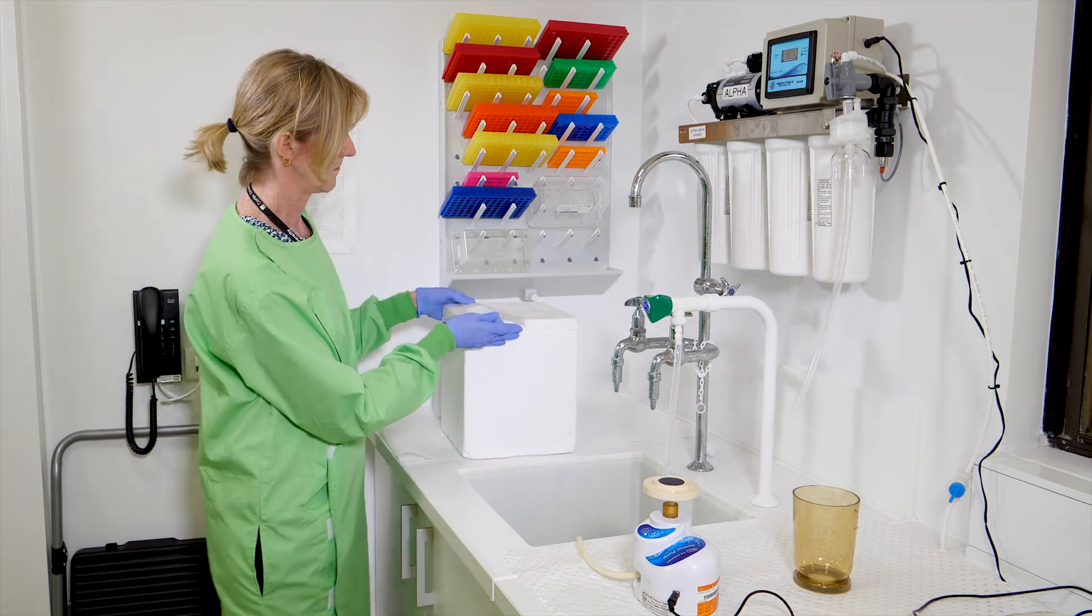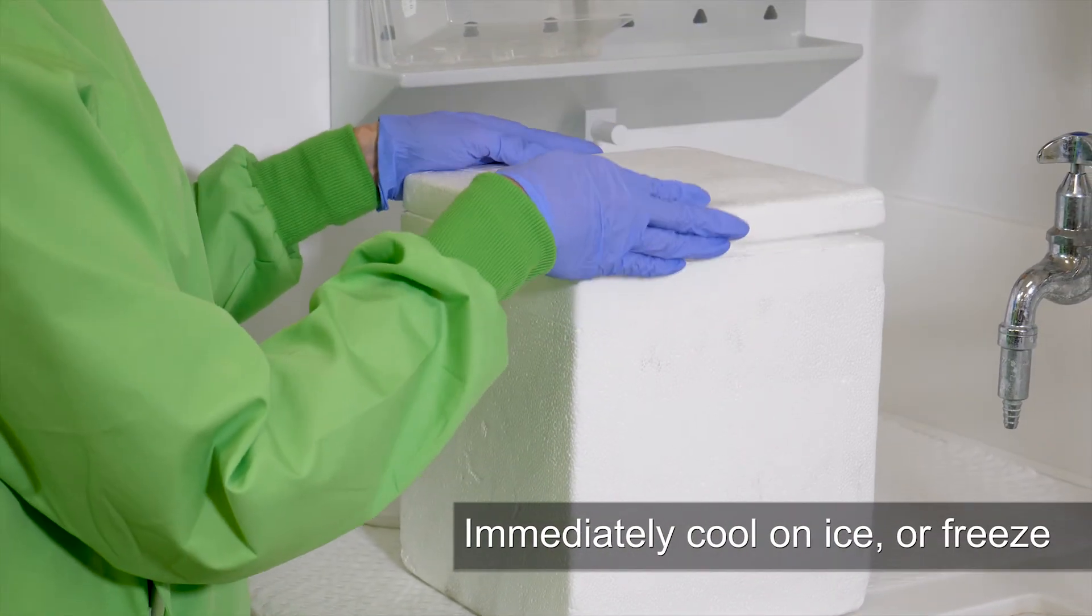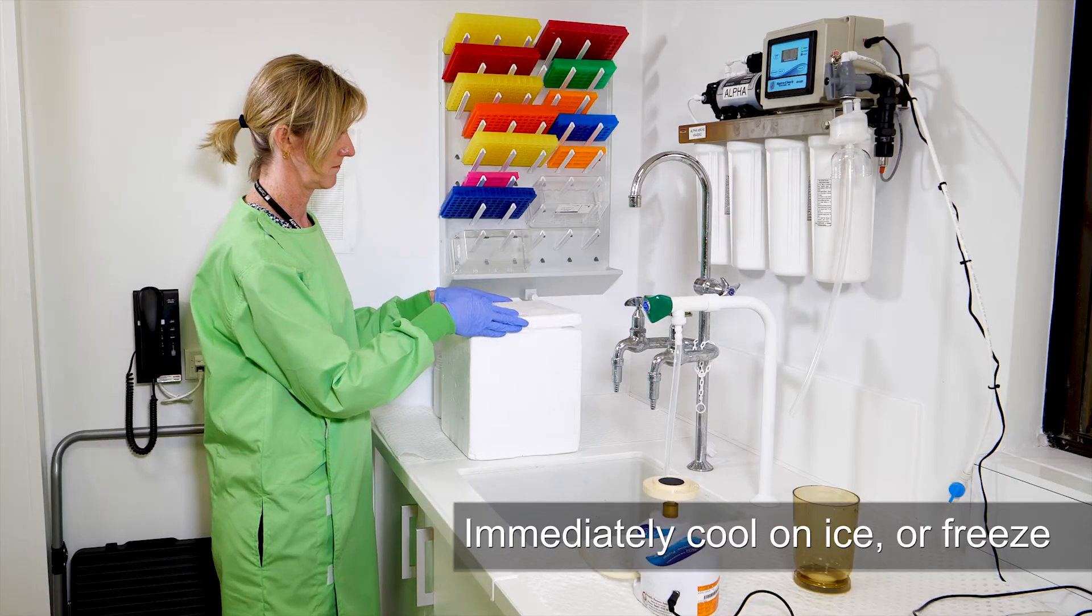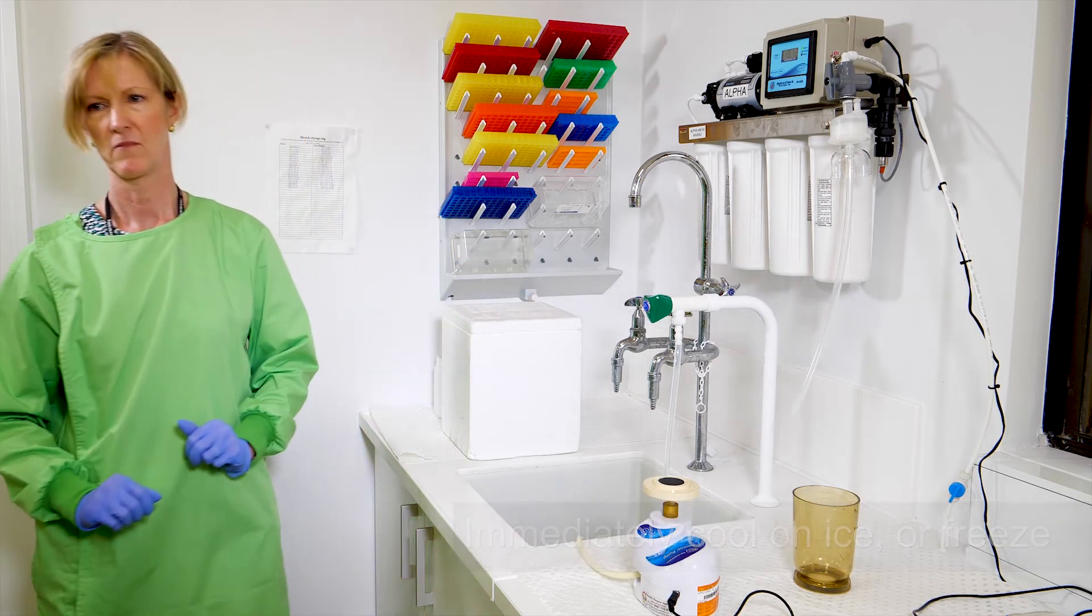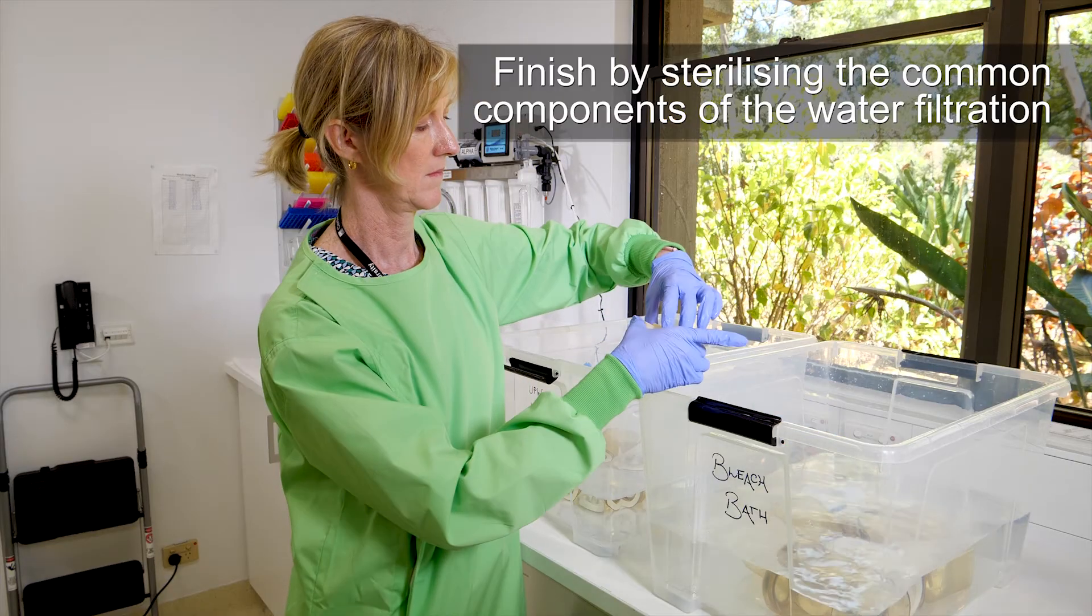It is important that the filter membrane is placed directly into an esky with ice bricks or straight into a freezer. If the filter membranes are not kept cold, then the DNA will degrade. Place the used funnel and filter base back into the bleach tub to soak for 15 minutes.